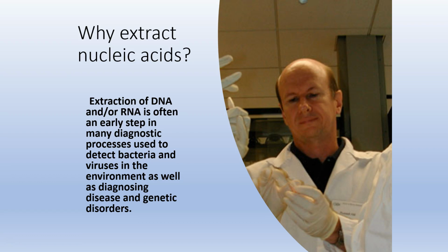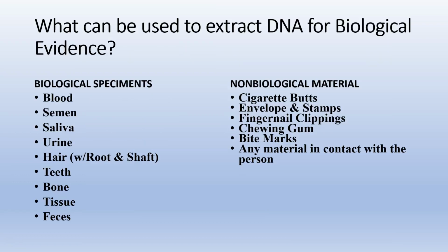Other reasons we want to extract nucleic acids is to study a disease process simply by actually sequencing the DNA or the genes associated, the exact genes or regions associated with a disease, and then studying the mutations or changes that are seen under various environmental conditions or under a normal versus a disease state.